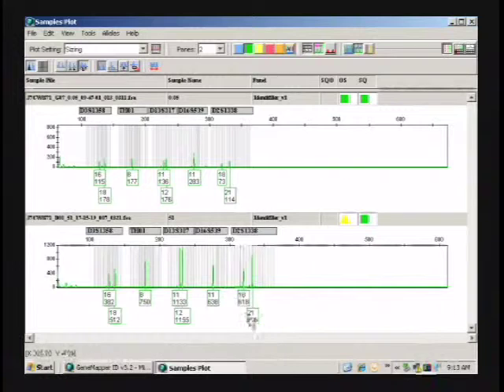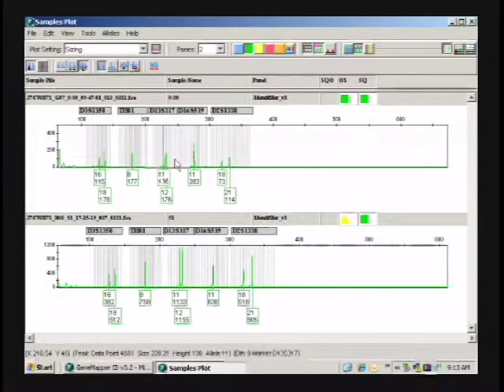And as you can see, notice you still have an imbalance here. It's still at 518, so it's still a nice peak height, and before it was at 73. But notice how the extreme imbalances will stay, whereas a smaller imbalance may tend to go away. I don't think that has anything to do with MinElute. That's just due to, if you inject the same sample 3 times, you'll get 3 different peak heights, and 3 different peak height ratios on a heterozygote. So I think that's what it is.